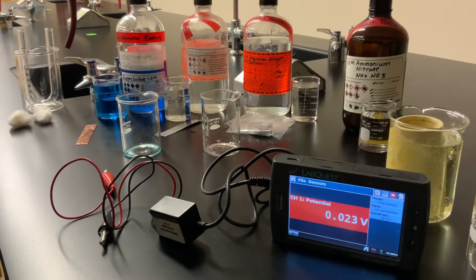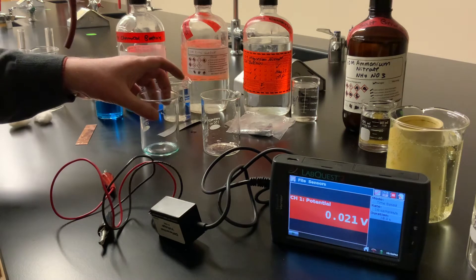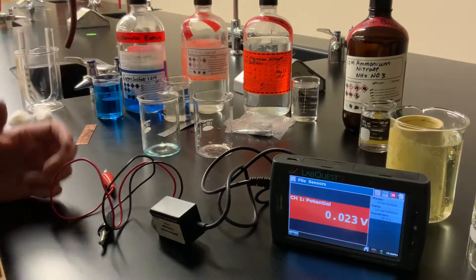In today's video, we're going to take a look at the construction of voltaic or galvanic cells. These are electrochemical cells where we take spontaneous redox reactions — reactions with large equilibrium constants — and we use them to generate electricity. In other words, we're basically creating a battery, although a real battery would have more than one cell working together. This is going to be a single cell.